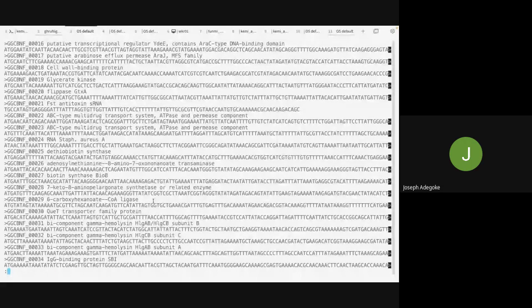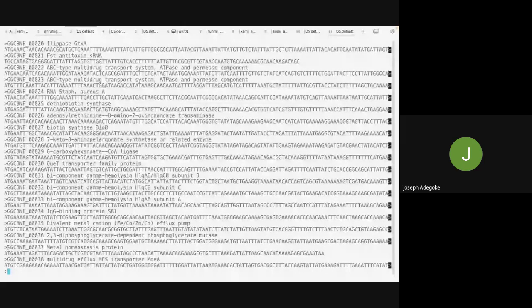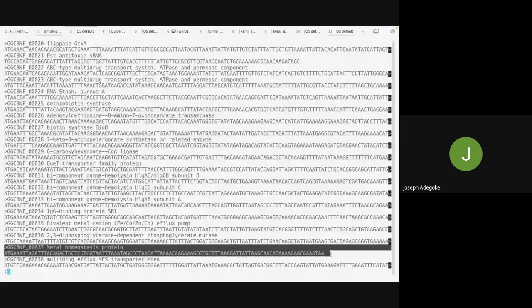So how do we extract this gene? I can extract it by just doing, okay, let me just copy from here. Okay, I've copied this out. But imagine you are presented with a large data set with a huge number of bacteria, maybe 150 bacteria, which is even small, like 1,000 bacteria. No, you won't be able to do that. It will be laborious and time consuming. So you want to write a script to help us extract the beta lactamase.